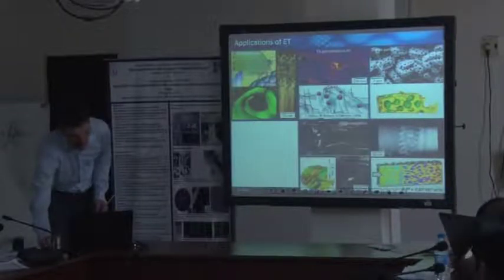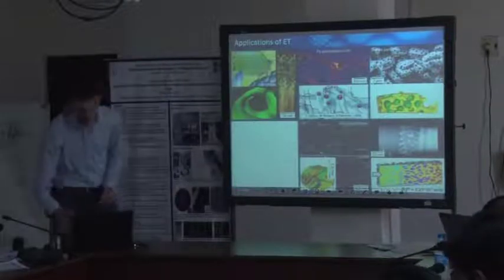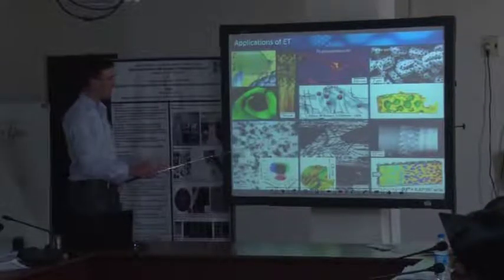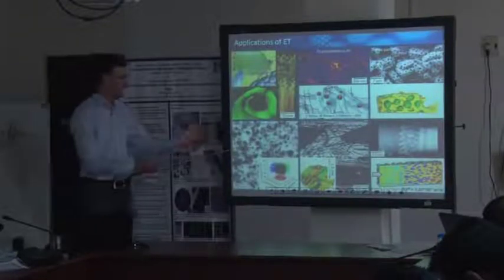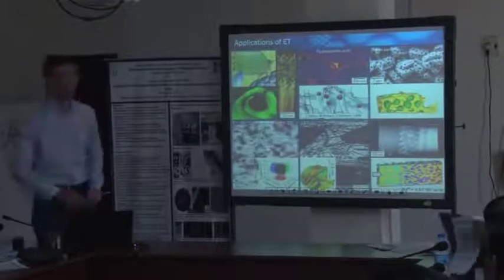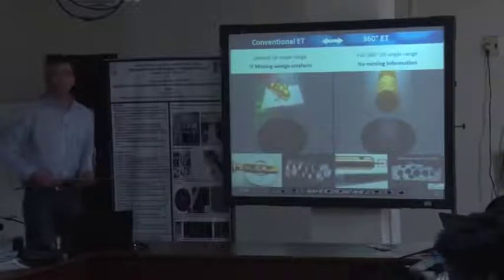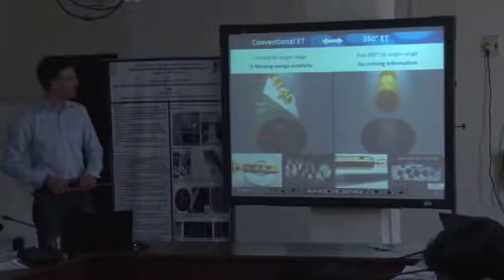There's another example you already saw. This is another very special tomographic technique about bilayer or trilayer graphene and crystalline membranes. And this is the distribution of particles. These are aluminum oxide particles distributed in an epoxy. This is used for electrical applications, like for transformers, for instance, as insulating coating. Okay? So there are many questions, like people might be interested in the 3D distribution of any material and density variation, like the porosity or the defects.